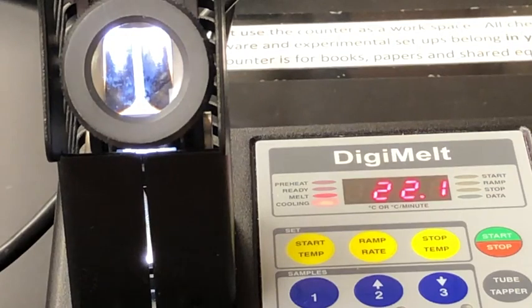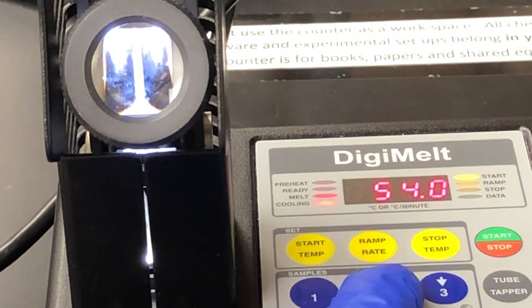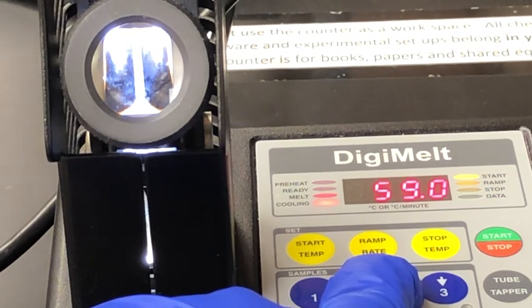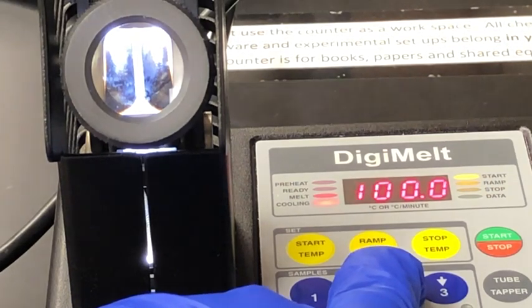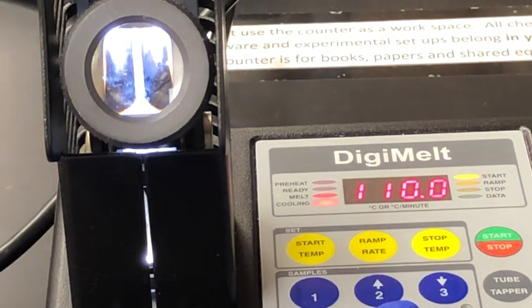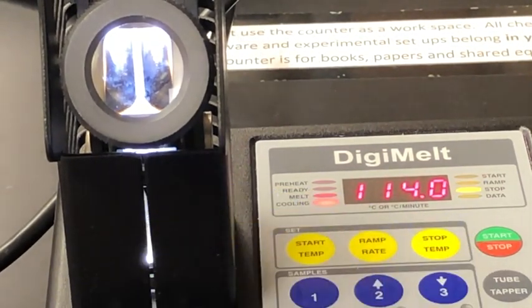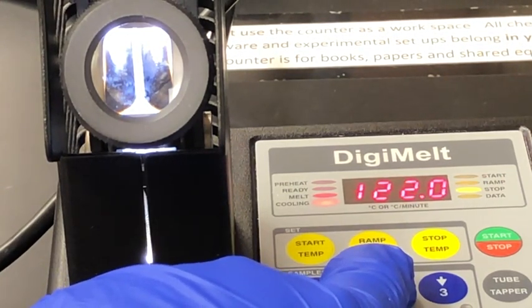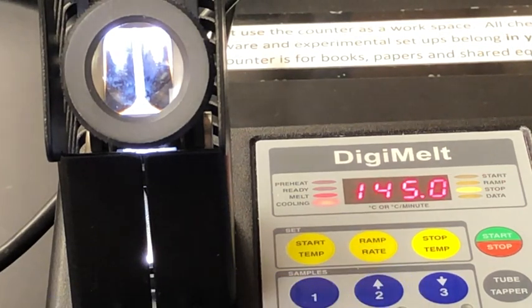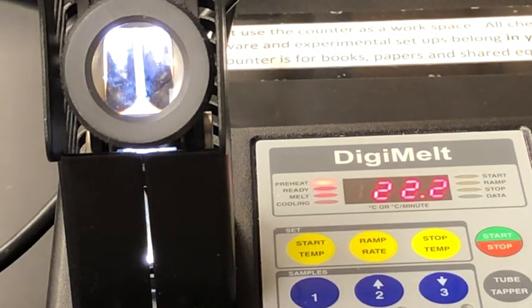The expected melting point of pure aspirin is 135°C, so I'm going to set my start temperature a little below that and my stop temperature a little above. I'm setting the start temperature to 110°C, the ramp rate to 2°C per minute, and the stop temperature to 150°C — just above 135°C. Now we'll wait for it to preheat and then we'll add our sample.